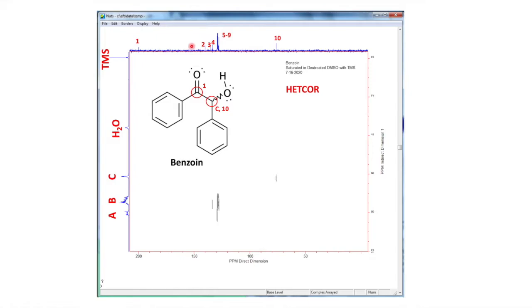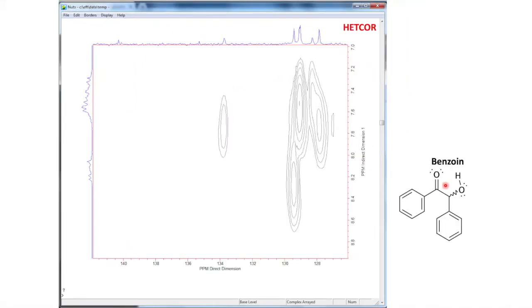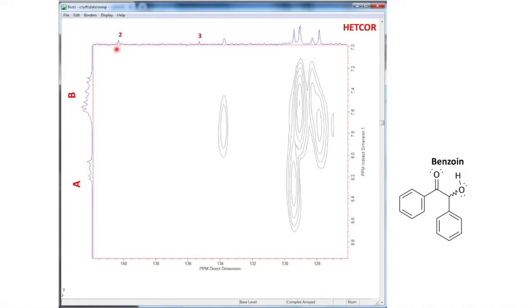I'm going to zoom into this area of the HETCOR. Here it is — benzoin label again, placed off to the side so it doesn't cover any area. This is signal grouping A like we saw before, and B. And now these are carbon signals: two, three, four, five, six, seven, eight, nine.